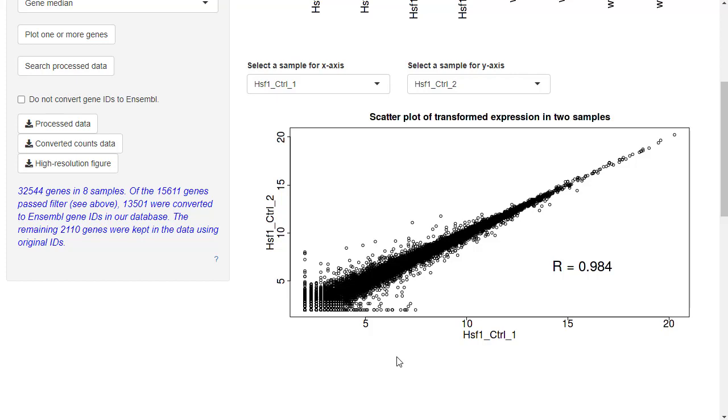That's 40% for a given specific tissue. We only need a subset of the genes, so 40, 50, 60% is a very good number. I don't want to get rid of 80% of the genes and have only 20% left. Or rather, I don't want to deal with 80% of the genes left. A lot of them is mostly noise.